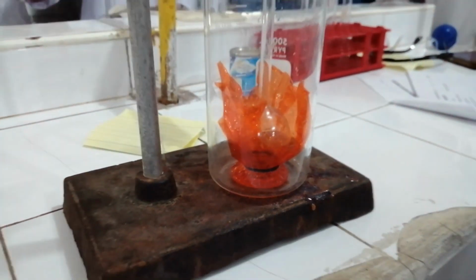Now, let us measure with a ruler the level of the sugar solution every 30 minutes for 2 hours.